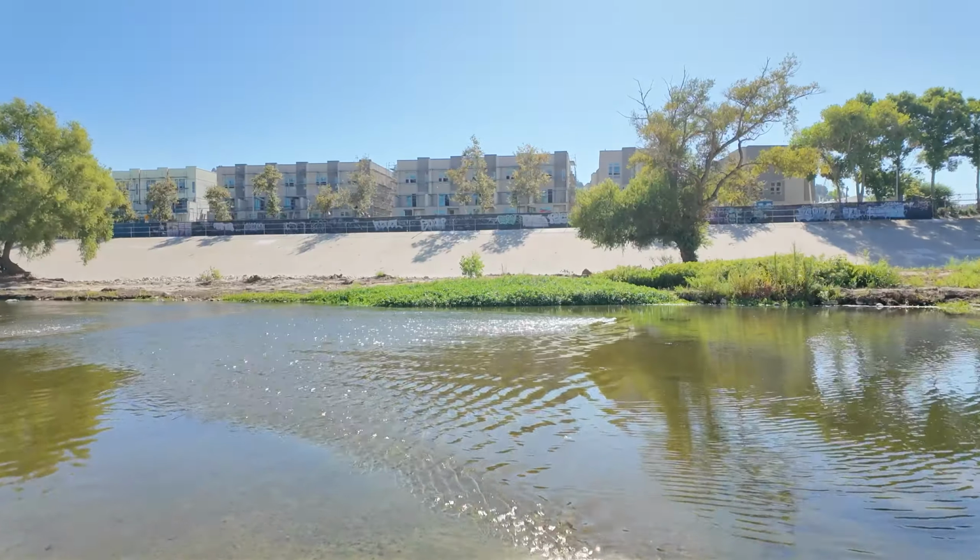So the TDS value for this side, the deeper side but slow moving part of the river, is 577 parts per million, which is really high. According to the EPA, this would be considered contaminated water. And so let's move to the more shallow side where we perhaps expect there to be more contaminants. Let's get to a place where I can at least fully submerge the probe and take another measurement.